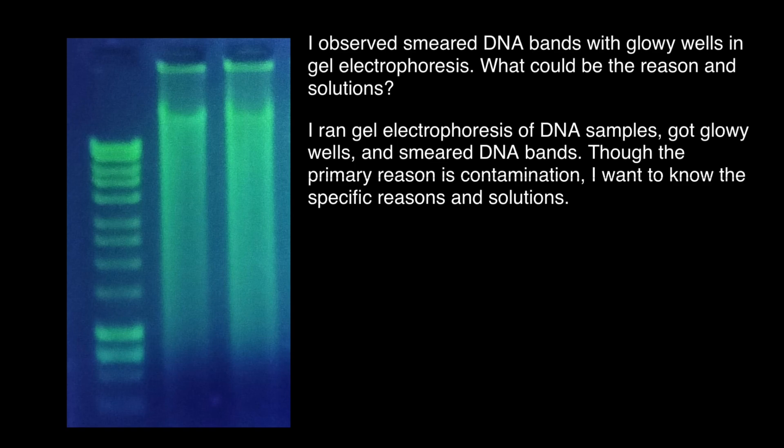Unfortunately, this person didn't specify if this was supposed to be plasmid DNA preps or genomic DNA. The answer is a little bit different for these two. If it is supposed to be a plasmid prep, then it seems this person has heavy contamination by genomic DNA, which probably comes from being too vigorous when mixing during the different steps in the plasmid lysis protocol.